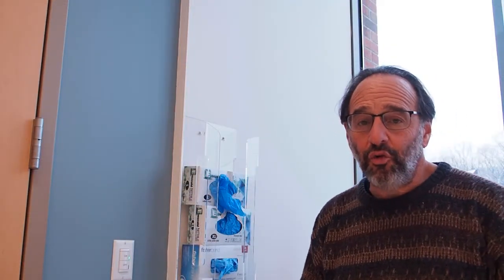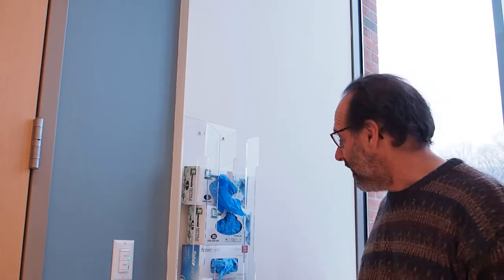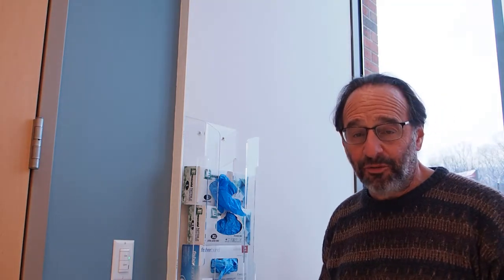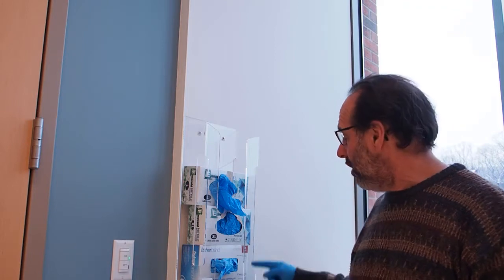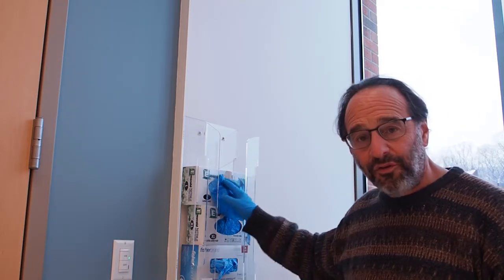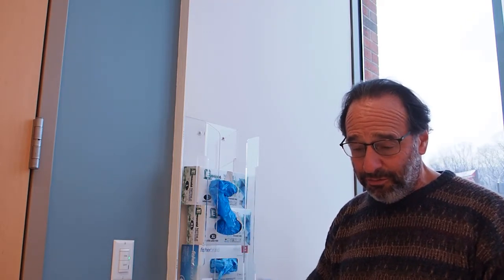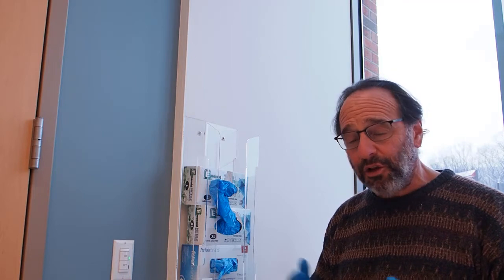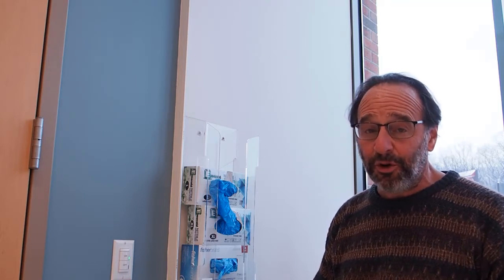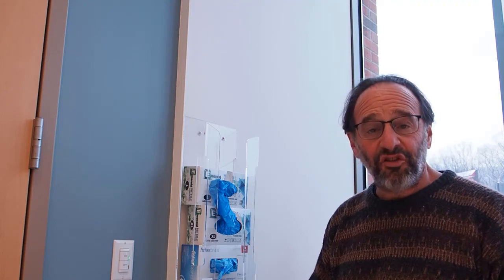In addition to wearing goggles as well as a lab jacket, sometimes you'll want to be using gloves to cover up your hands, depending on what you're working with. And so in the labs, there'll be a wall rack that has boxes of gloves of different sizes for you. And so if you feel like you want to wear them, just wear them. They're there for your use. And in particular, if your instructor tells you you should wear them because we're going to be using something particularly toxic or hazardous, then go ahead and make sure you wear them.